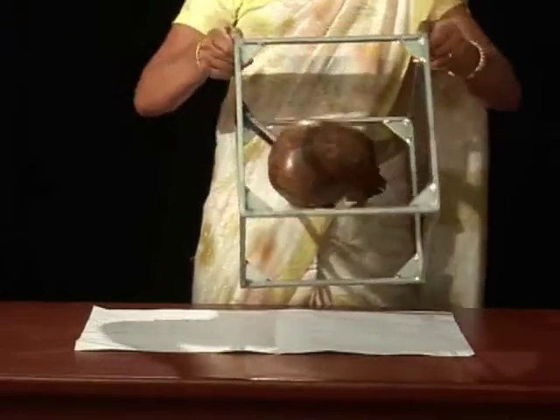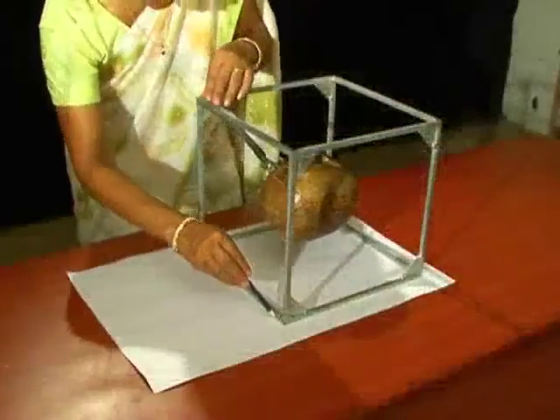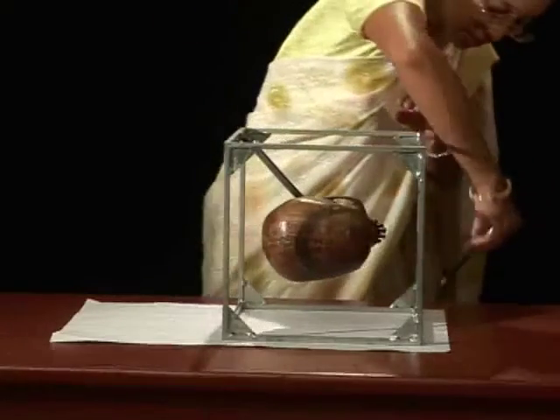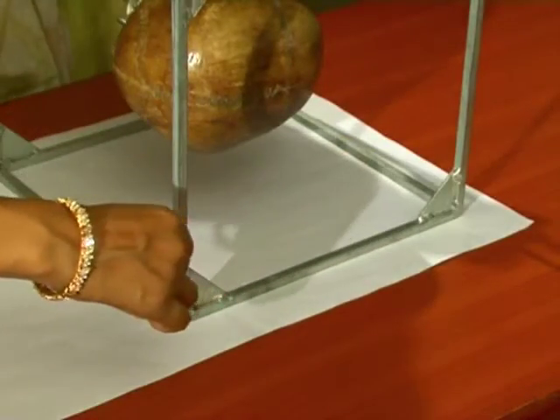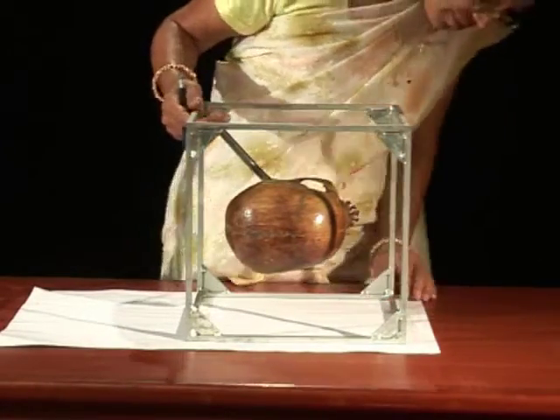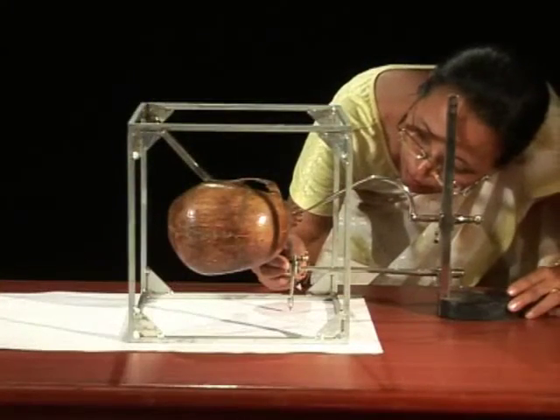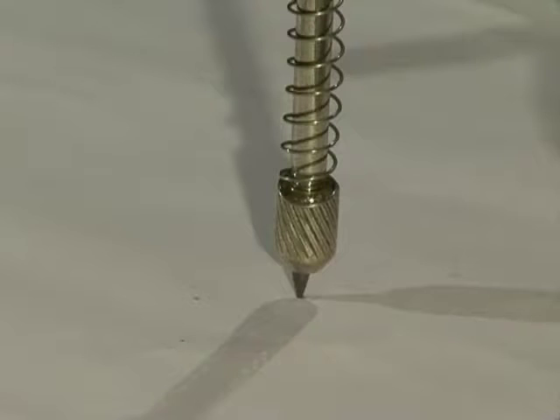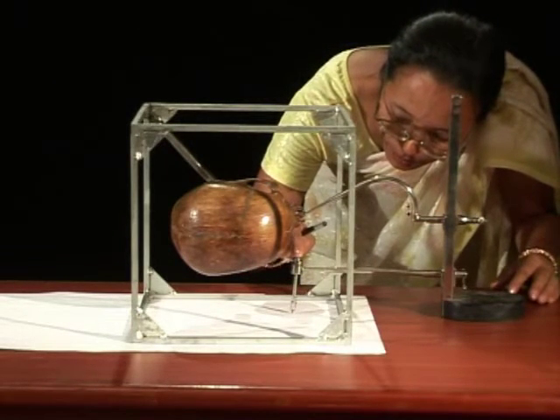The cubic craniophore is then placed on the drawing sheet of paper, and the outline of the forearms of the cubic craniophore is drawn with a pencil as close to the frame as possible. The outline so drawn will help in placing it back in its original position if any disturbance has taken place on the cubic craniophore. The arrangement of the diagraph is such that the tip of the curved arm and the tip of the pencil remain exactly in the same vertical line.